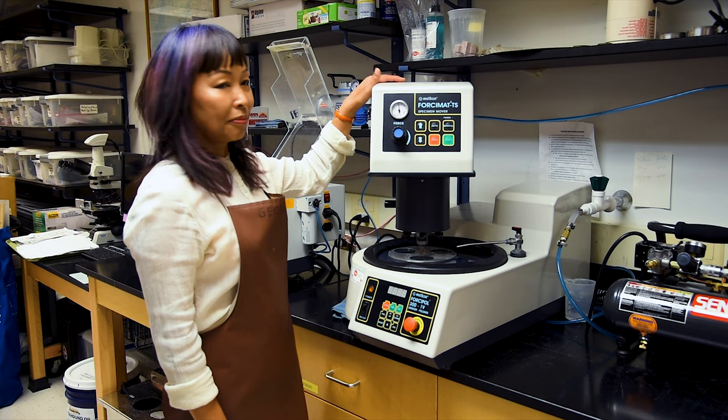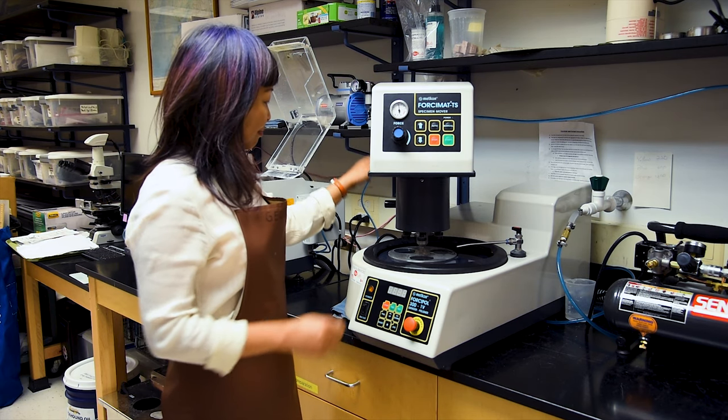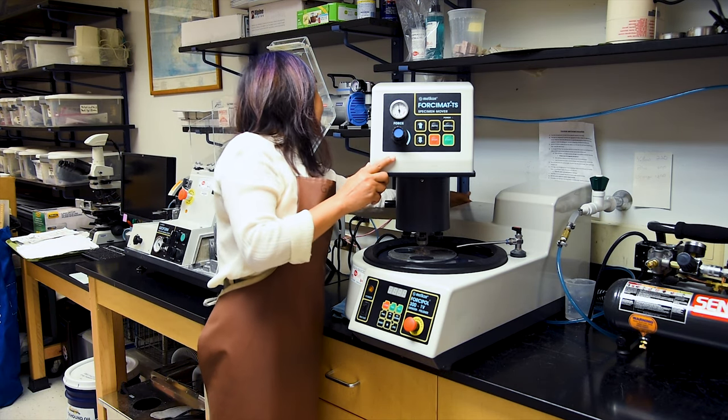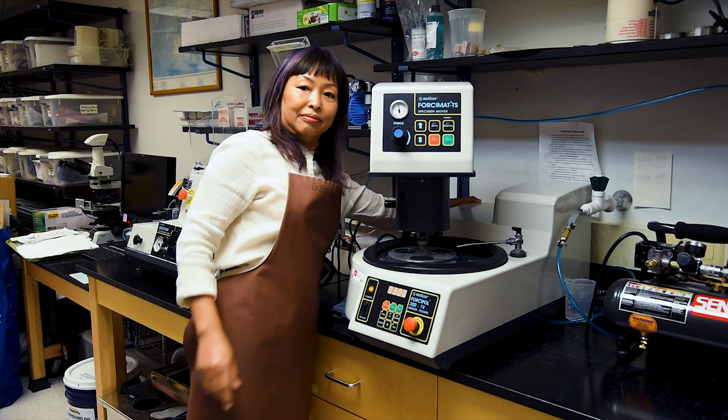Another set of equipment that we will be using is the ForzaPole, which is a grinding wheel used for polishing sample chips in preparation to be epoxied to a glass slide.